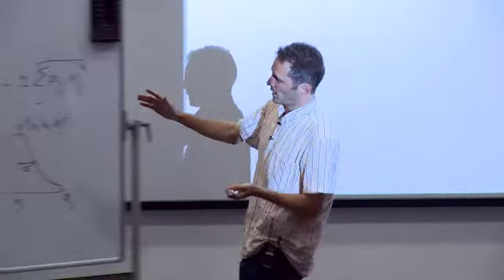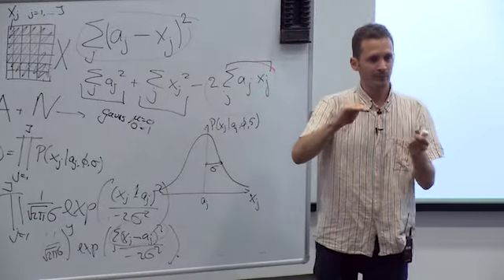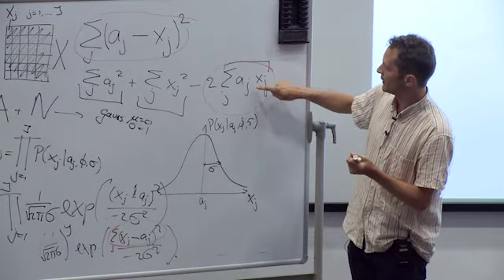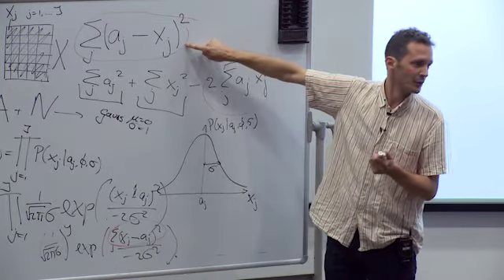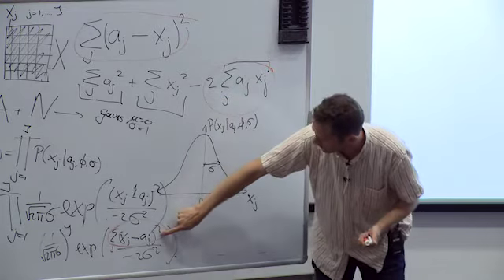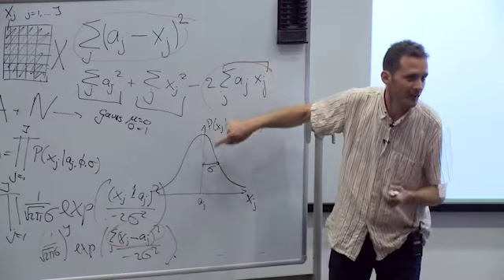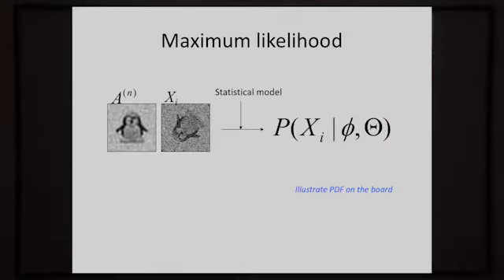So all these things with the Gaussian error model have led to something where the maximum is exactly at the same position, because where the cross-correlation was the highest, the least squares was the lowest, and where the least squares is the lowest, that's when x becomes a, and the probability becomes again the highest. So we're still very close together, but what we're going to do with this probability is something very different, and that I'll explain on the slides.